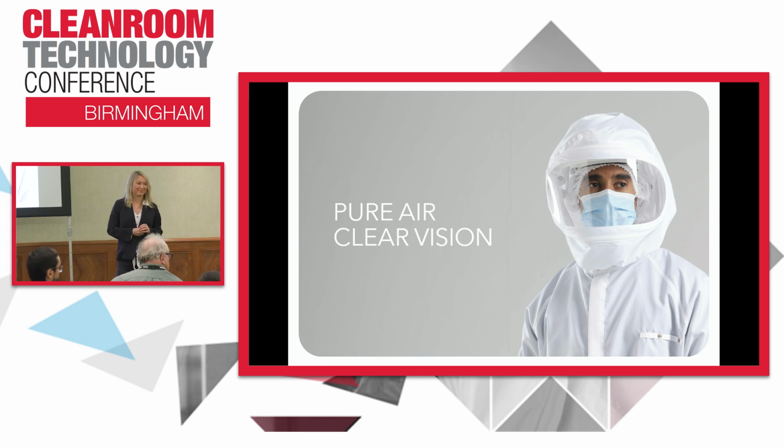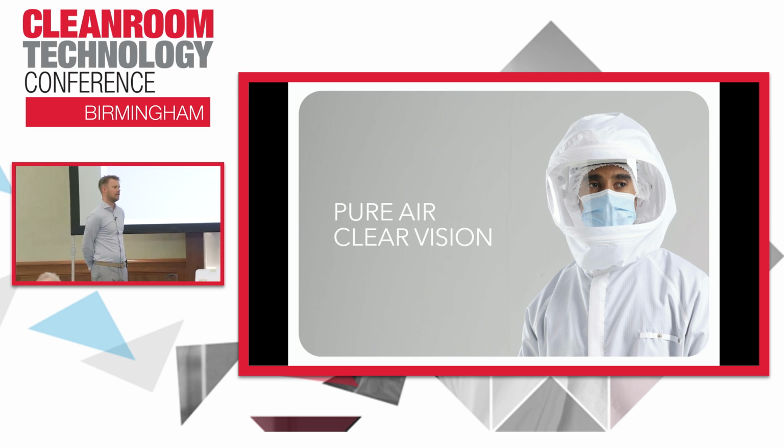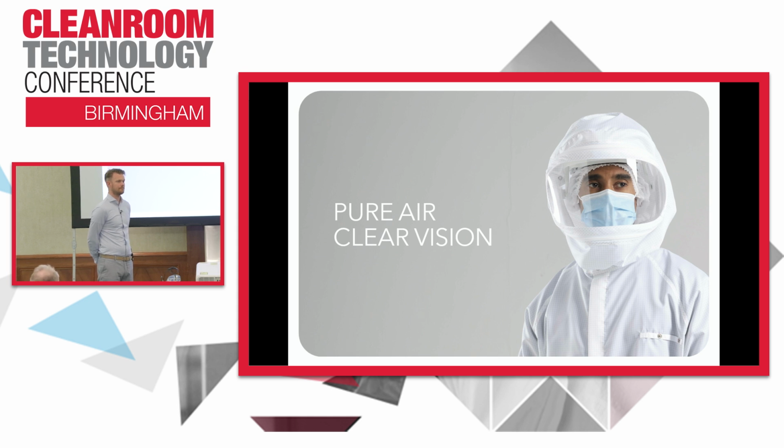Hi, I've just got a question about the headpiece. Is there a way to get this cleaned or sterilized? What is the process with that? Yeah, you can wipe this with IPA, and we are coming with a manual on how to do it properly. Great, thank you. I'll do one more question. There was a lady at the back. You still patient? There you go.